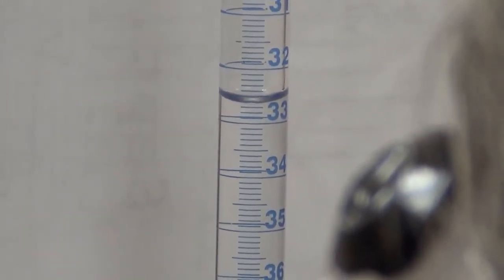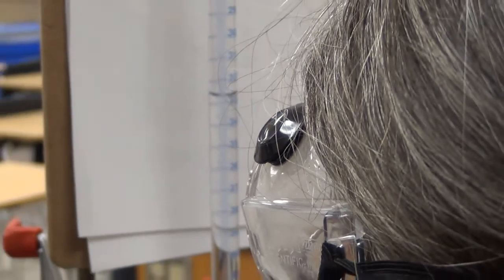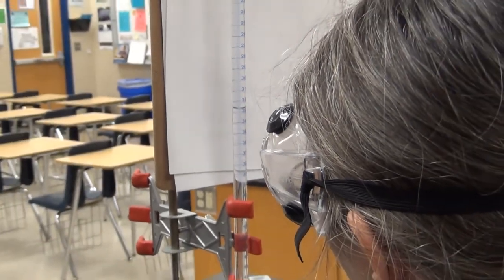It's in between 32 and 33, looks like right at the point seven line, so that would be thirty two point seven zero. Three two point seven zero, thirty two point seven zero milliliters for the ending volume of our second acid trial.